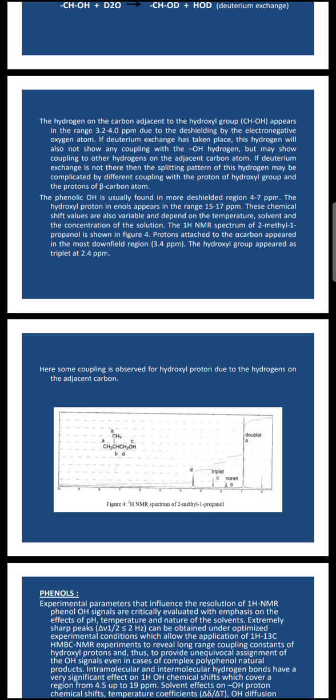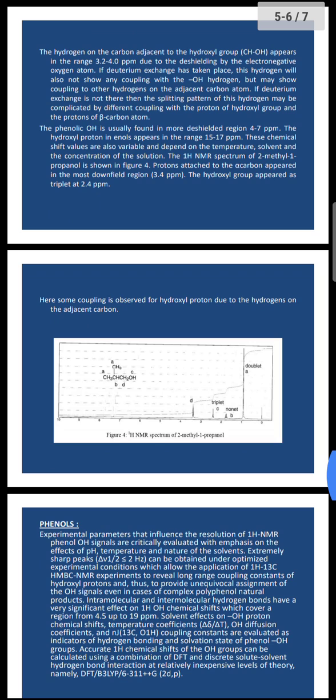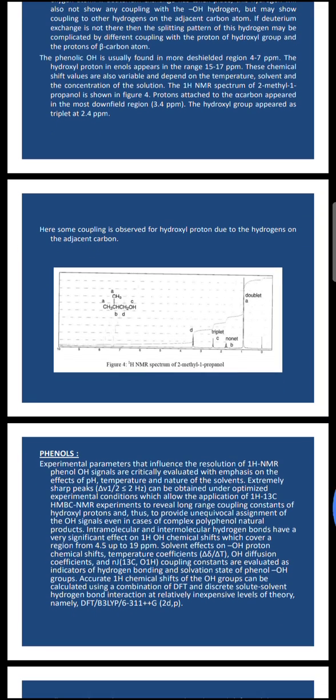Proton attached to the alpha carbon appeared in the most downfield region, 3.4 ppm. The hydroxyl group appeared as triplet at 2.4 ppm. Here some coupling is observed for hydroxyl proton due to the hydrogens on the adjacent carbon.